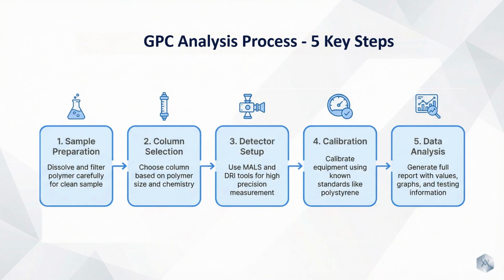Third, the sample is injected into the GPC system. Fourth, separation occurs inside the column based on size. Finally, detectors generate data for MN, MW, PDI, and retention time, which are interpreted together, never in isolation. This holistic interpretation is where experience really matters.